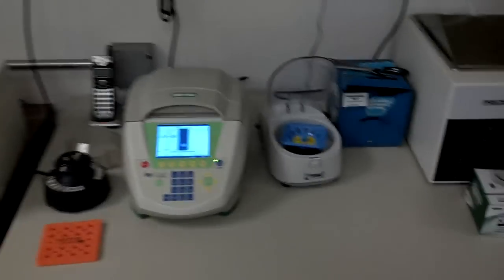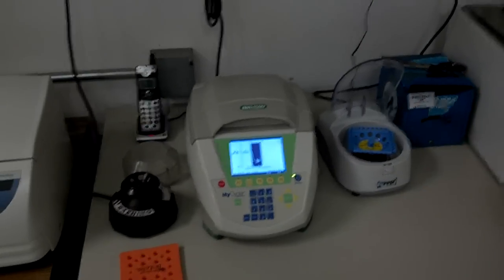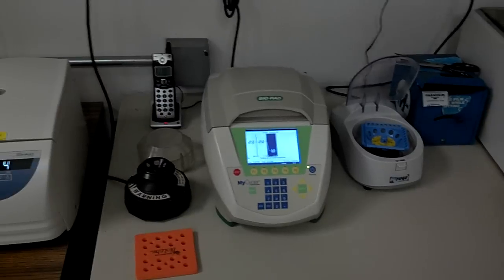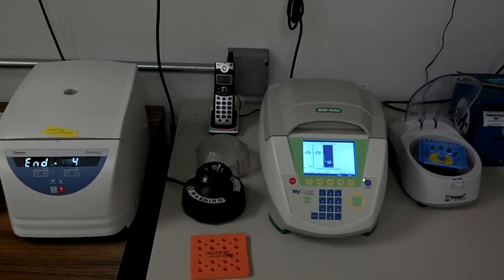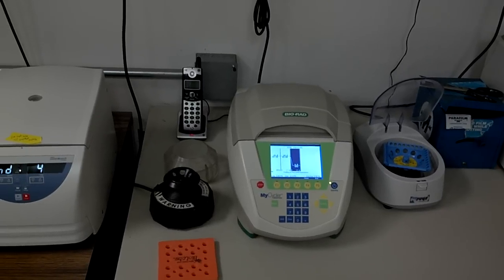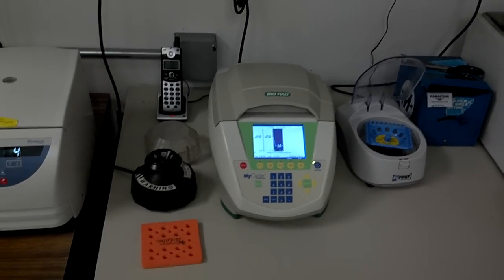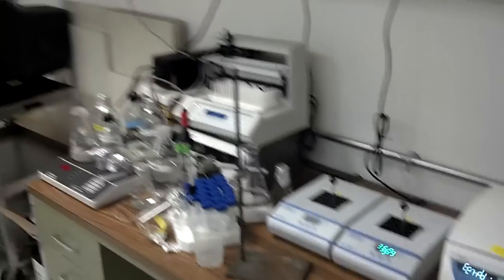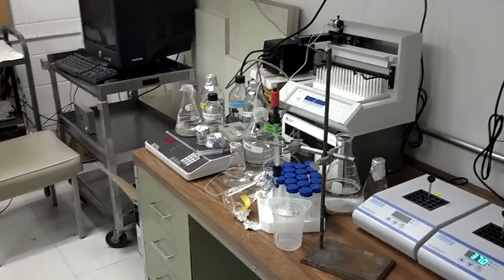This is PCR, polymerized chain reaction. This is where primers are added to single-stranded RNA and put in temperature gradients that goes up and down, denaturizes them. Causes them to come apart and go back together. We can tag them. This is actually Kirk's stuff, one of the post-docs. He's working with RNAs.